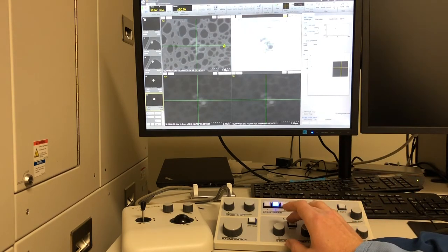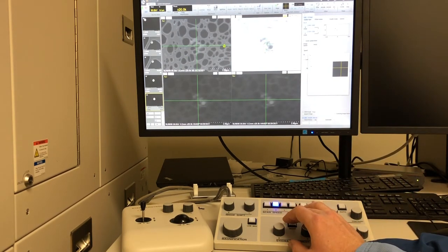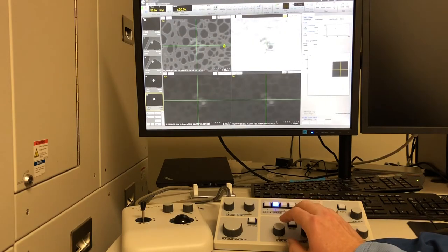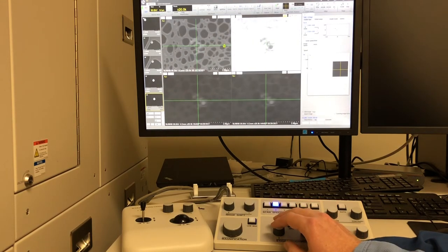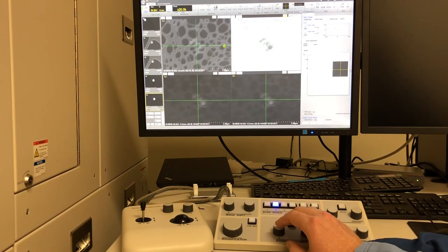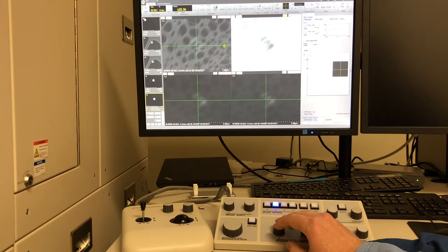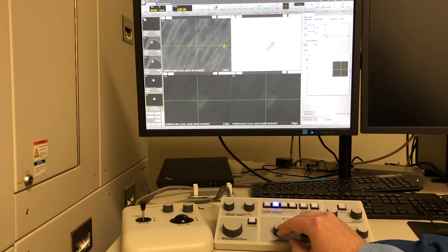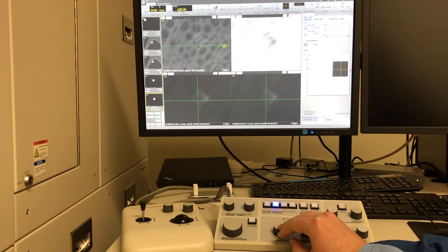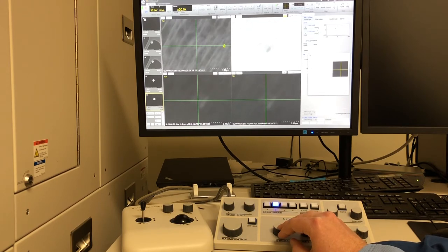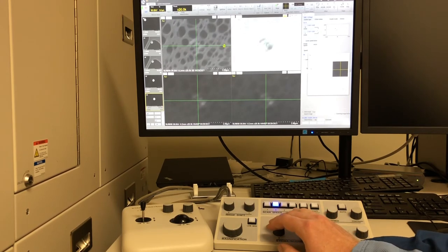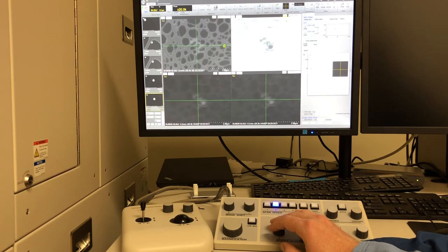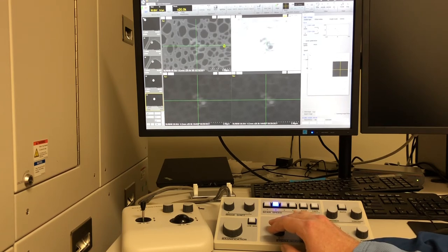Next, we will go to stigmate, align, X axis. And in this case, we'd also like it not to shake. I'm making it shake a little bit worse so you all can see what that would be like. So that would be bad. And then we just correct it so that it's just taking place very minimally.